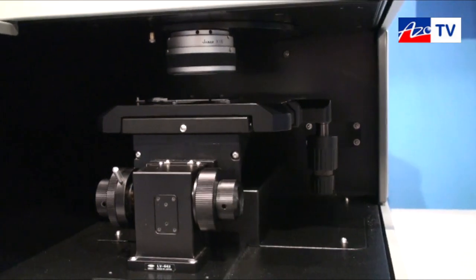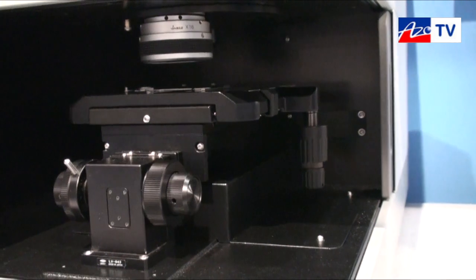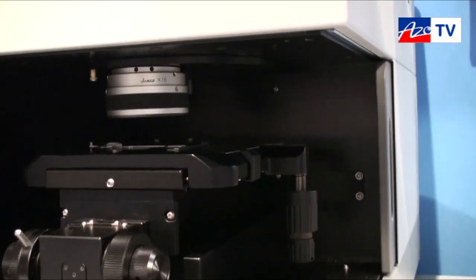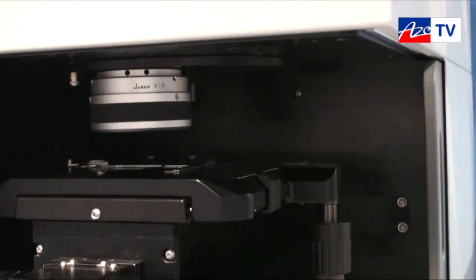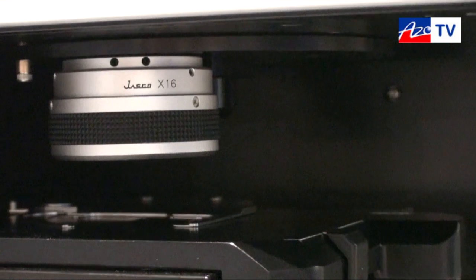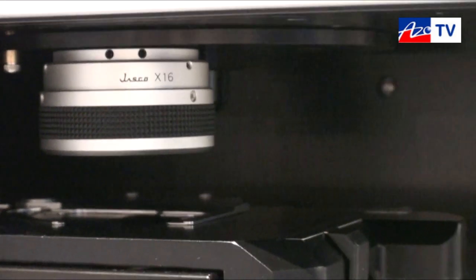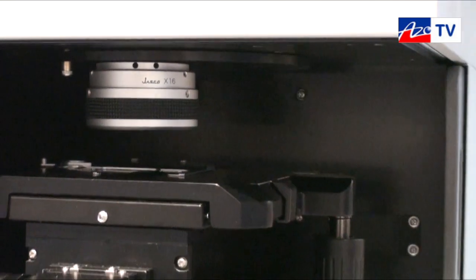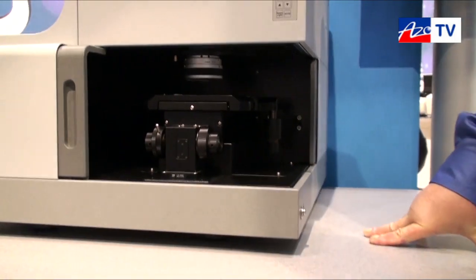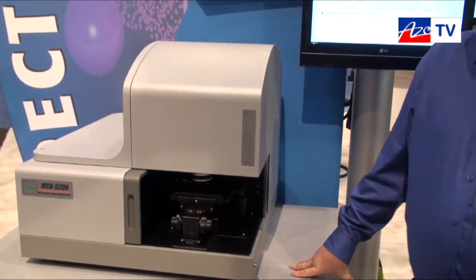So we find quite a bit of flexibility and capability in terms of doing a wide variety of samples — from specialty optics to small filter systems to LCD screens, lots of different materials analysis applications. The system can be fitted with an XYZ auto stage instead of the manual stage, and we can do mapping of a sample and get even more information on the sample morphology and the chemistry of that sample.